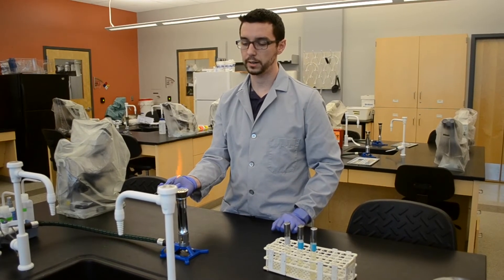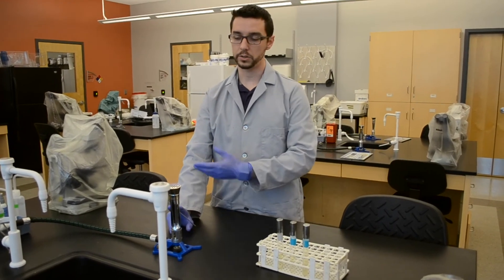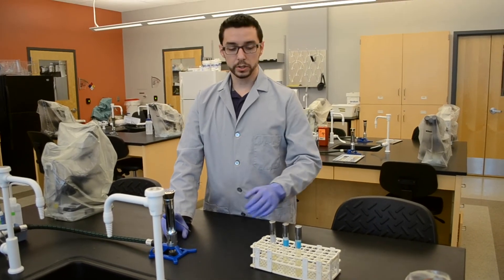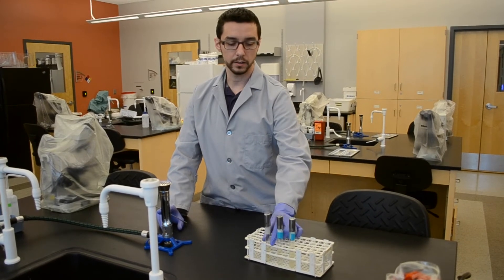Sterilize your loop, making sure the metal gets red hot. While you're waiting for it to cool, simply leave it within the zone of the flame. Once it cools, we're going to demonstrate how to do a broth-to-slant inoculation.